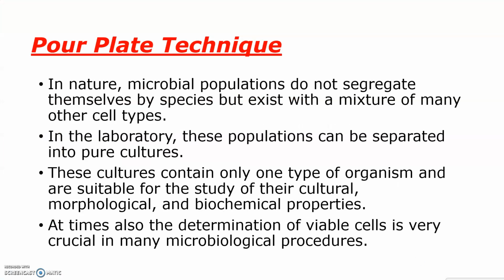So we have the necessity to separate them into different species for isolation, to find out which type of disease and to rule out certain types of disease. In our laboratory, these populations can be separated into pure cultures. What do you mean by pure culture? Pure culture means those cultures containing only one type of organism.